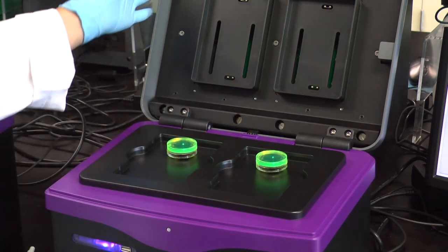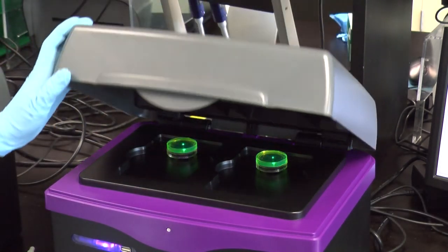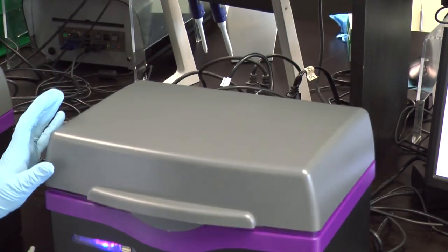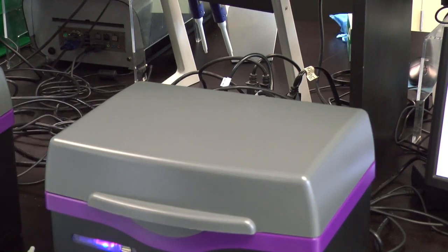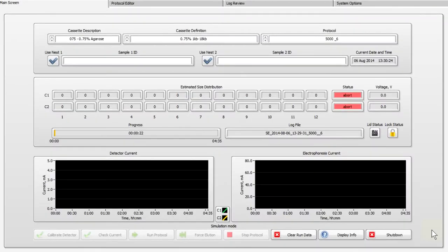Place the fixture over one or both detectors with the dark film strip facing down. Close the lid. In the software, go to the main tab.